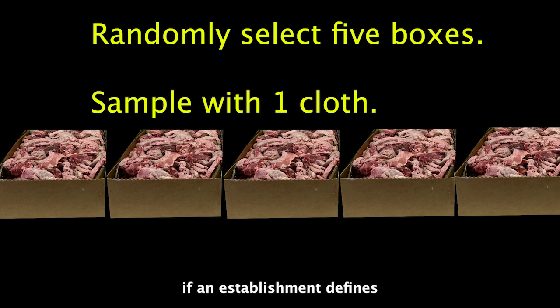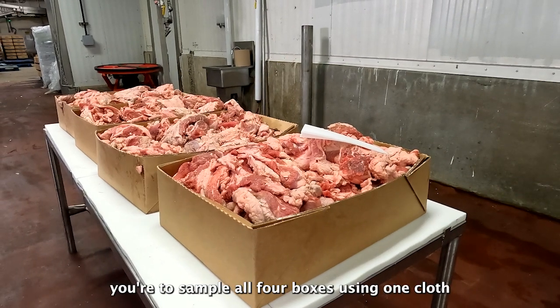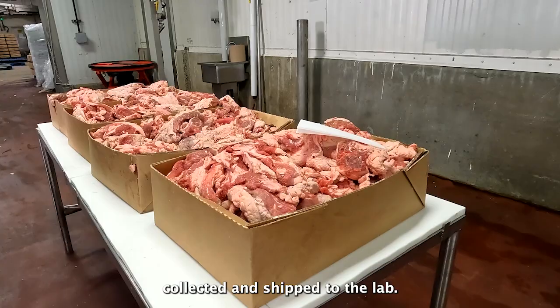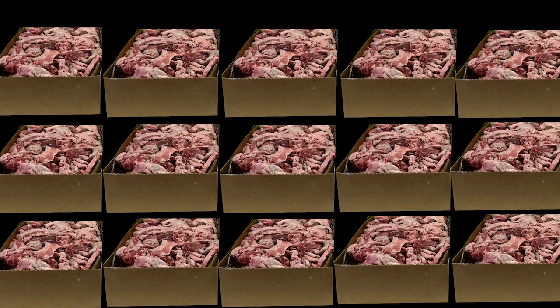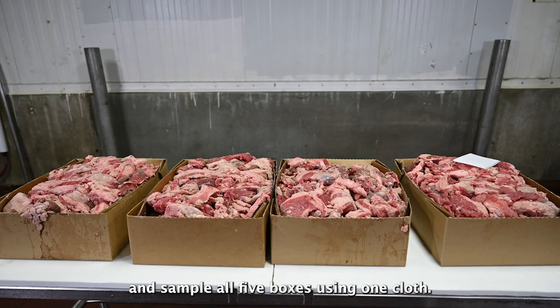For example, if an establishment defines its lot as four boxes, you are to sample all four boxes using one cloth for a total of one cloth collected and shipped to the lab. If an establishment's lot is greater than five containers, you are to randomly select five containers and sample all five using one cloth. In today's lot, there were four boxes, so we'll sample four boxes.